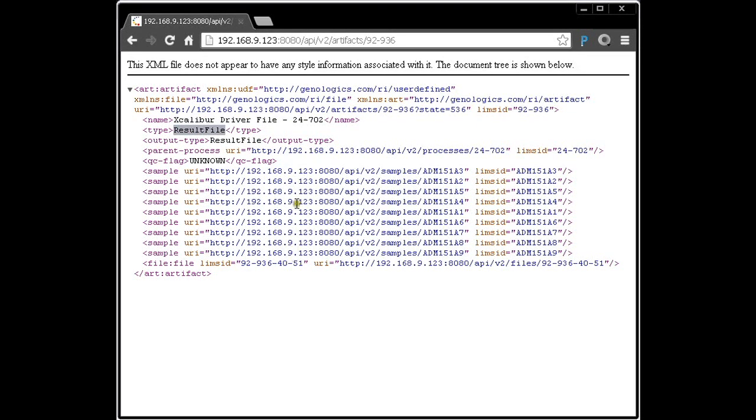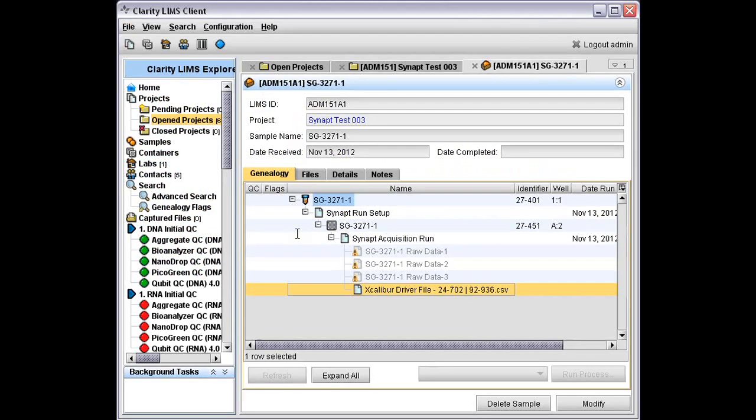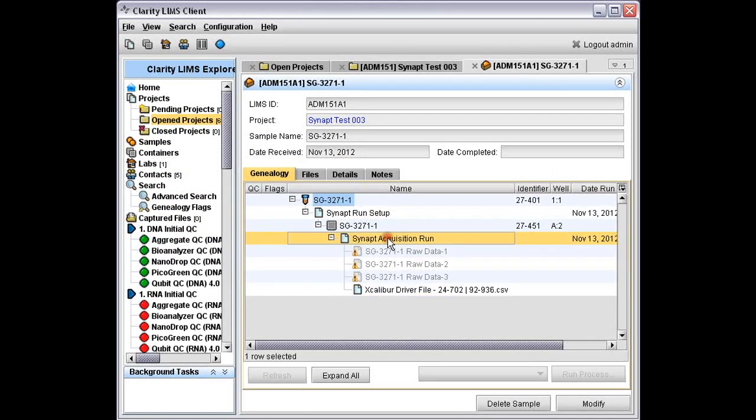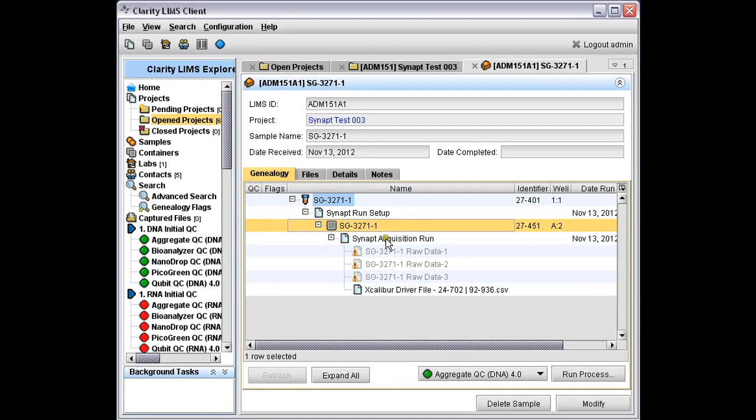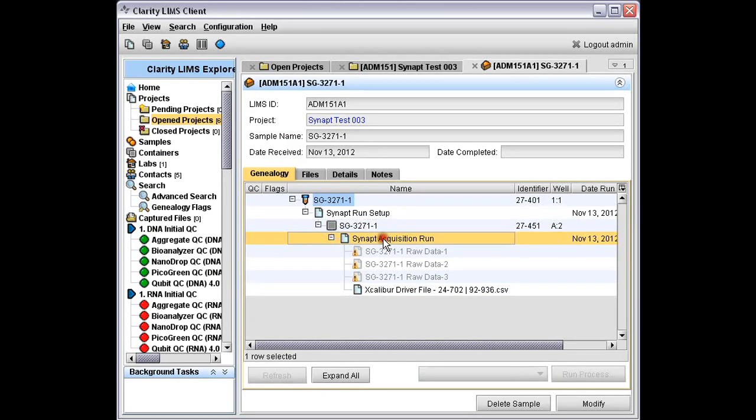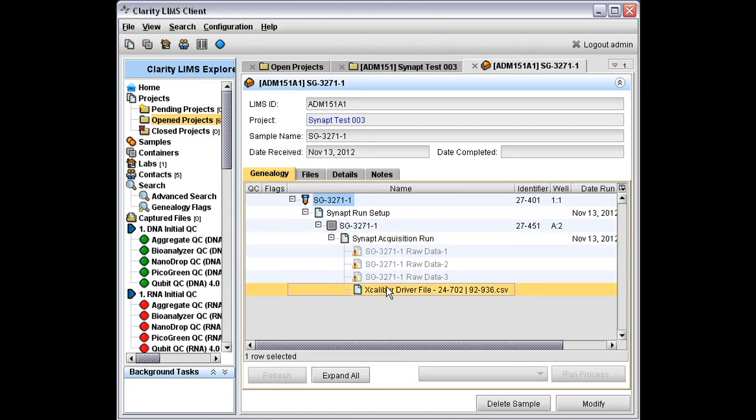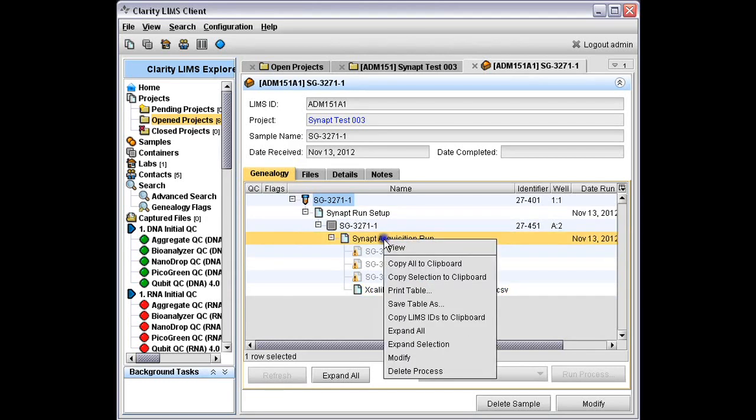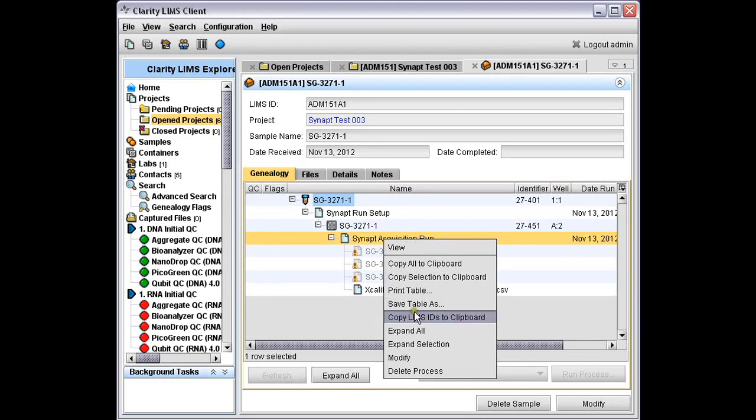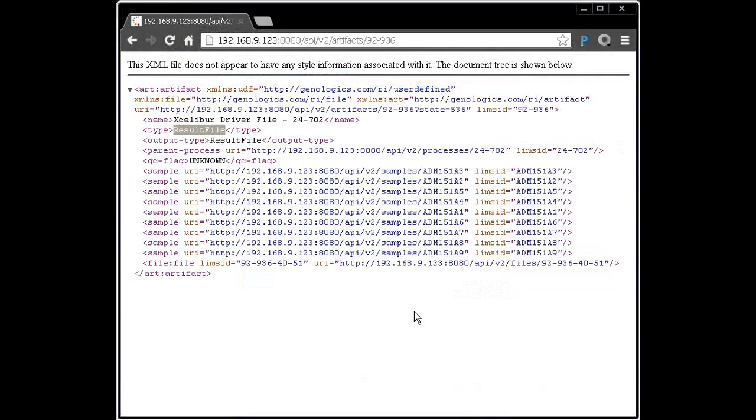We can examine that further by actually looking at the process which created it. Switch back to LIMS. Here's the process which created it. From the genealogy, we know that it took in this plate, and we ran this process on it. One of the outputs was the driver file or the result file that we just looked at. Let's go and look at this process. Copy the LIMS ID, switch back to the browser.